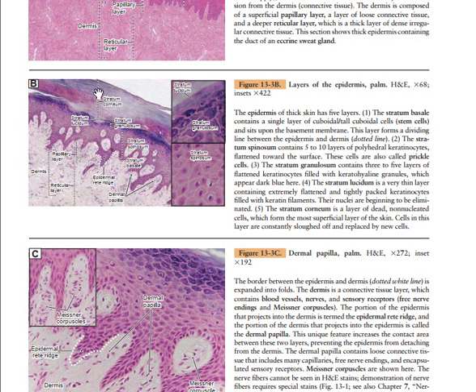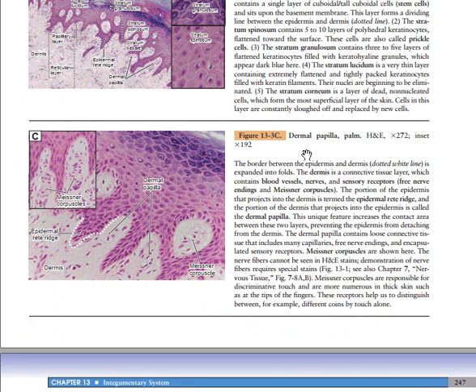At the stratum corneum, the cells are dead and they contain keratin. In the stratum lucidum, the cells are still living, containing keratin. But at the stratum granulosum, they contain keratohyaline granules that are highly pigmented, is it clear? So that's why it shows on the hematoxylin and eosin stain. It's very dark in the stratum granulosum. Then underneath the stratum granulosum, you have the stratum spinosum, and close to the papillae here, we have the stratum basale. Is it clear?